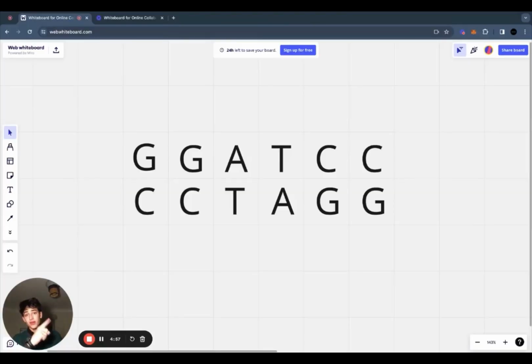That just means that if you have a DNA pattern that looks a little bit like this over here, then you can see that the top half of the DNA sequence is the exact same as the bottom half of the DNA sequence, but they're only mirrored. They still match though. But why is that? Well, I'm pretty sure it's because it's more effective. When you have a palindromic sequence, you only have to make a cleavage point at one site, as opposed to two.